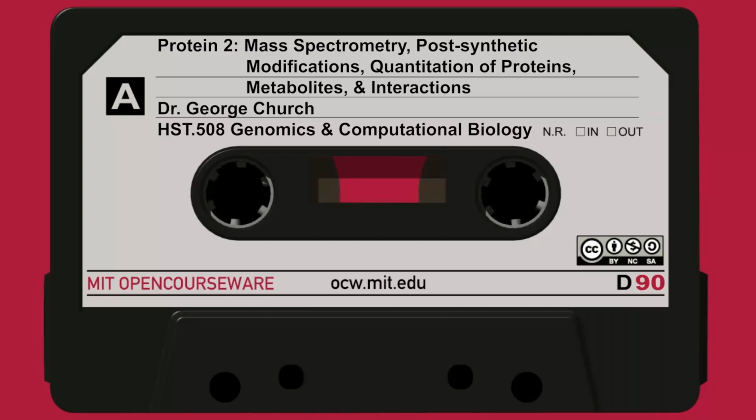But for right now, what we want to do is ask, how do we analyze the complex spectra that comes out? First, you get a fairly simple spectra, which is just a list of all the masses of all of the peptides. And remember, some will be weak and some will be strong because of this voodoo ionization. But then we break them. However, whatever the intensity of the original peptide is, we'll make a bunch of daughter ions, which will be the B ions coming in from the N-terminus and the Y ions from the C-terminus. And you'll have this big mixture, a nested set. They get increasingly large as you get further from the N-terminus in the B ion series and their complements. And the sum of the B ion with its complementary Y ion has to be the original molecular mass corrected for the chemistry that occurs right at the cleavage.